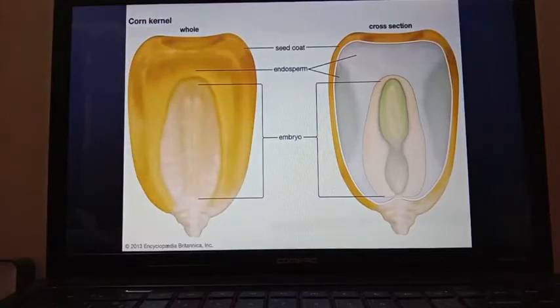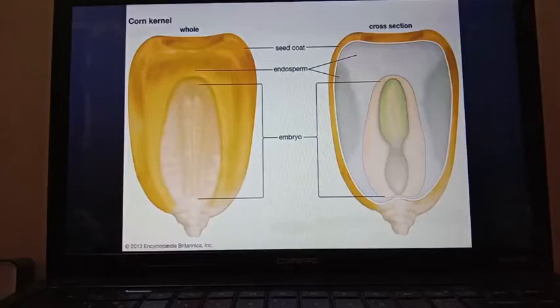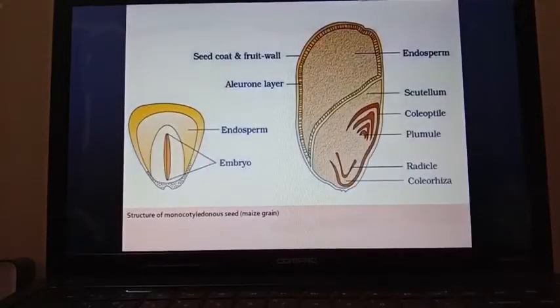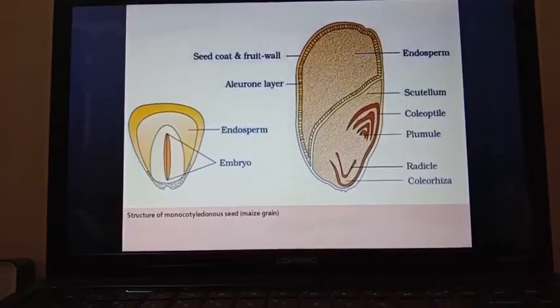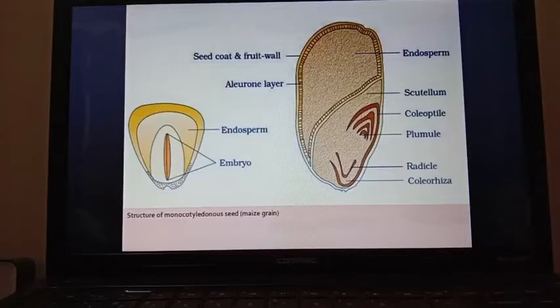After cutting into two equal halves, you can see the internal structure of the maize grain. It is known as a grain because the seed coat and fruit wall are both fused together. The outer covering is this fused seed coat and fruit wall. The broader part mainly consists of endosperm, which is where nutrients are stored for the embryo during germination.